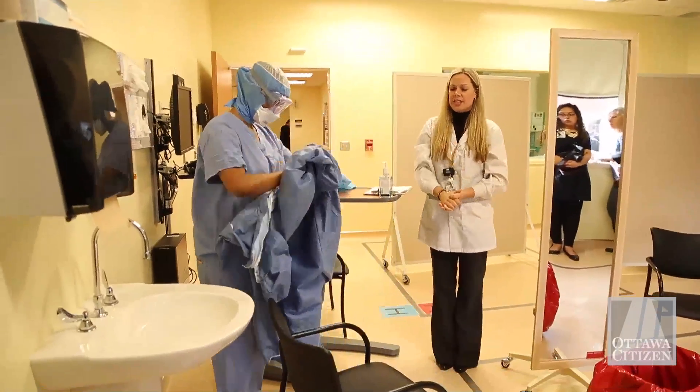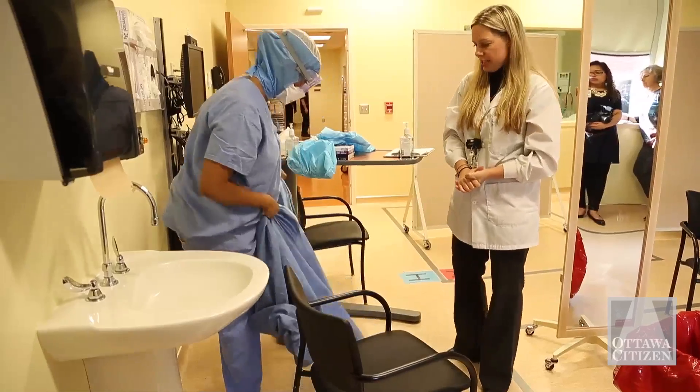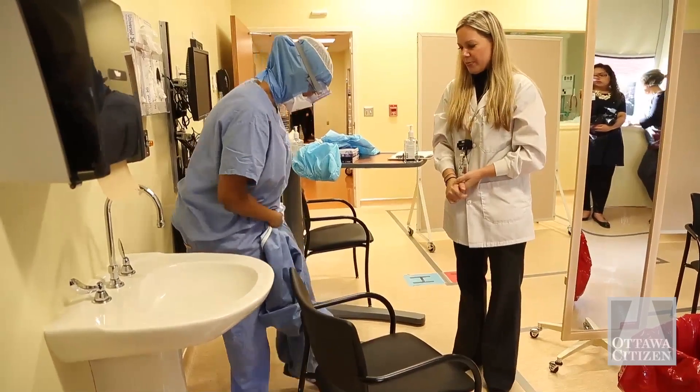She can do this sitting or standing, so we do have stools available outside the empty rooms for people who don't have great balance.